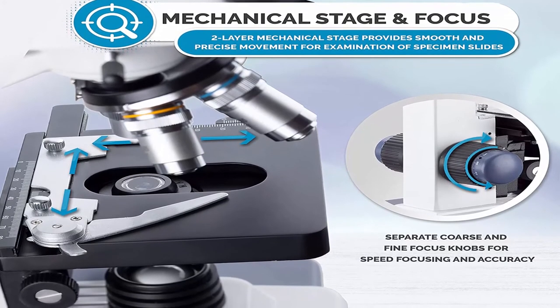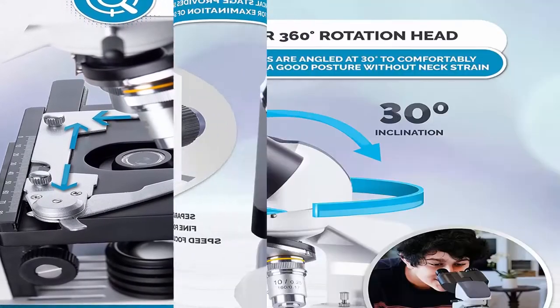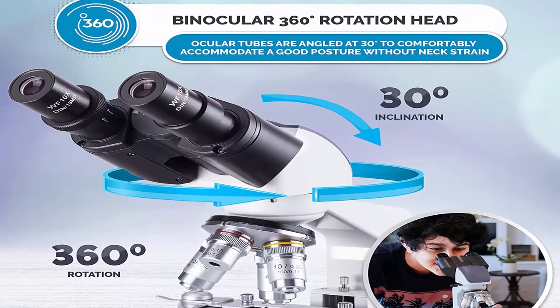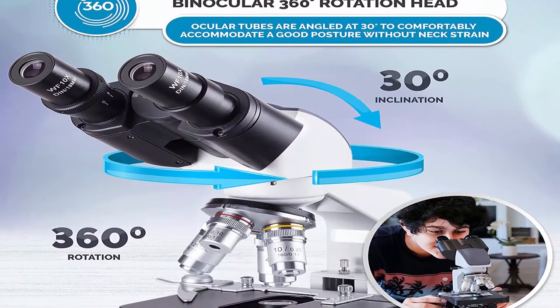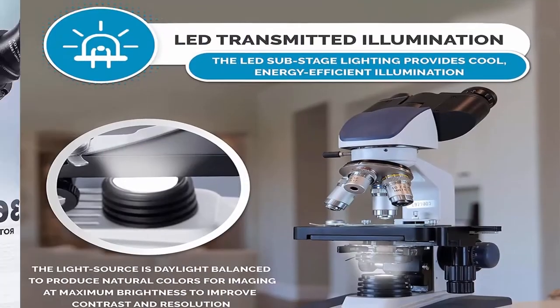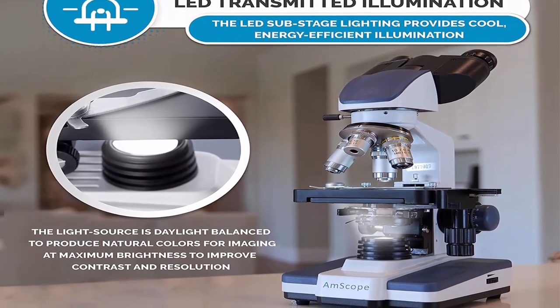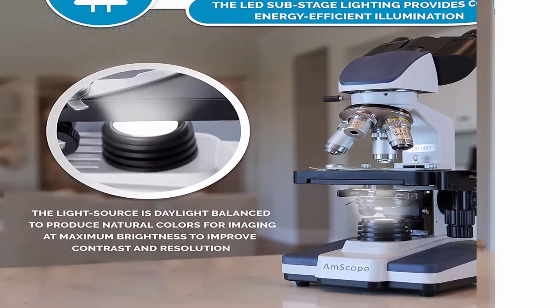Powerful single-bulb LED illumination with dimmer. The 1.0 MP camera comes with user-friendly editing and processing software for Windows, offering advanced features including stitching, EDF, and measurement. Compatible with Windows XP, Vista, 7, 8, and 10.